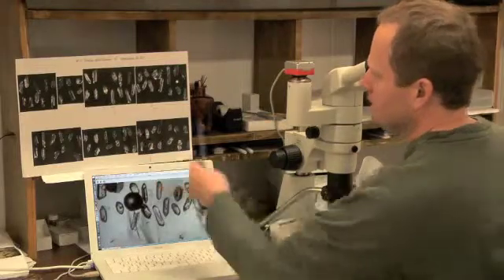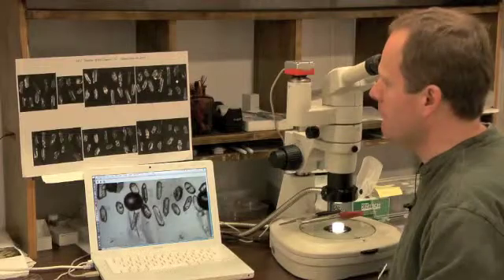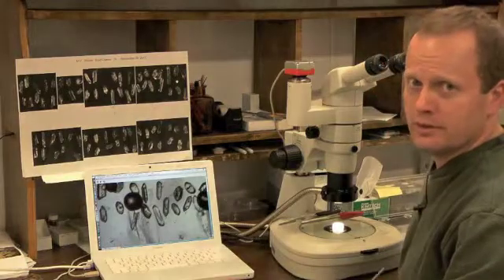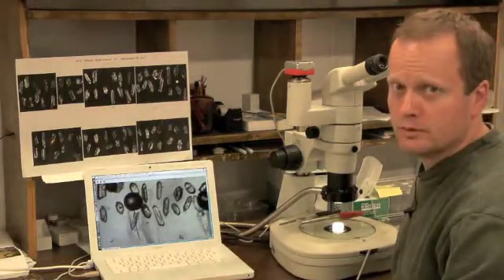I also have a cathodoluminescence map of the same zircon crystals. That map images the internal growth zones within the crystal interiors, and that lets me select fairly simple crystals for further analysis.